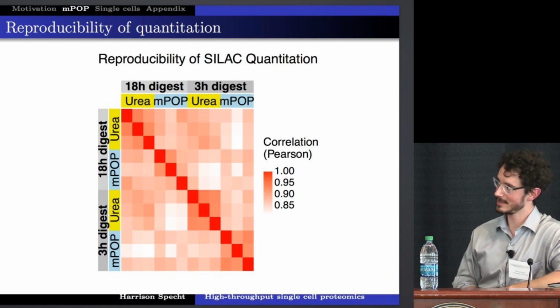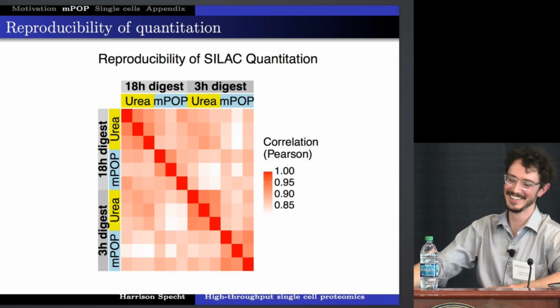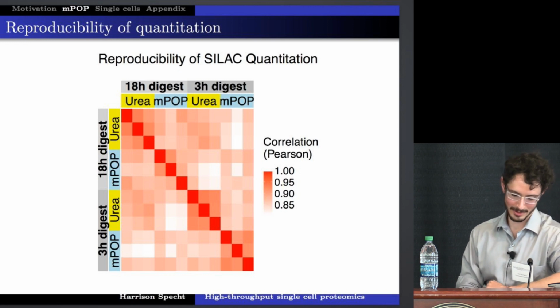But if we don't eliminate that sample and look at the other ones, you'll find similar agreement in these 4 squares and these 4 squares as you do in these 9. Okay, and then my other question is that, we'll talk about that later. Yeah. My other question is that do you see any oxidation differences between the methionines and maybe even cysteines when you do the freeze thaw versus the urea?